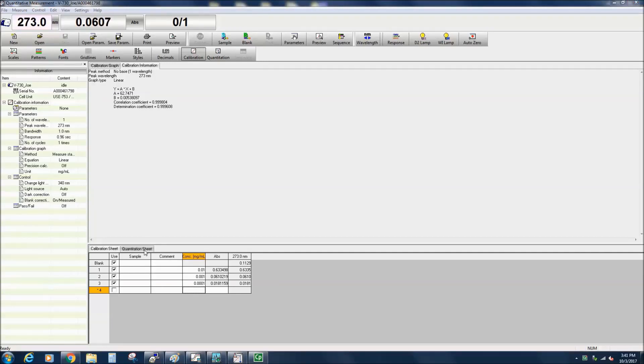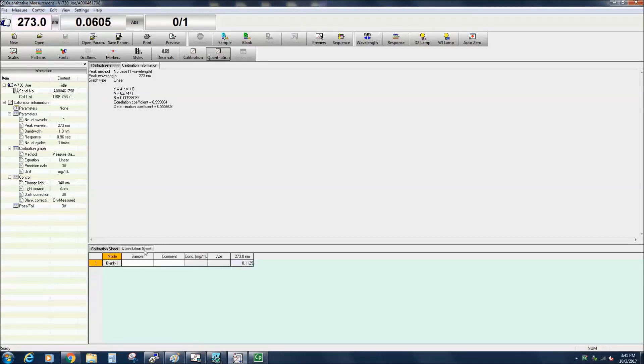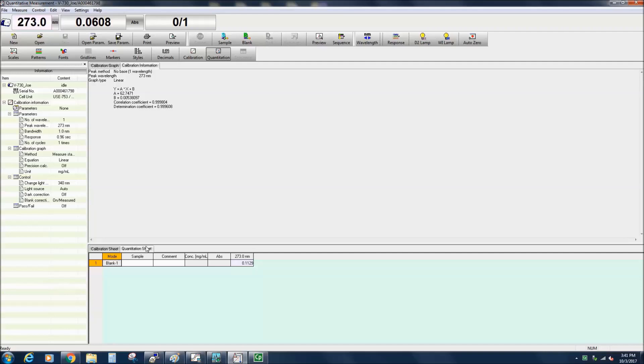To perform the quantitative measurements on a set of samples with unknown concentrations, double-click the quantitation sheet or select the quantitation icon. Place the sample with an unknown concentration into the sample side cell holder and select the sample measurement icon.